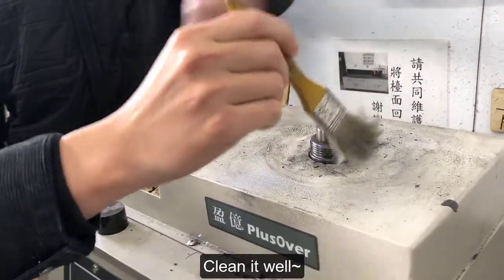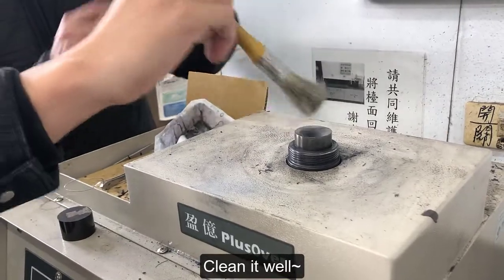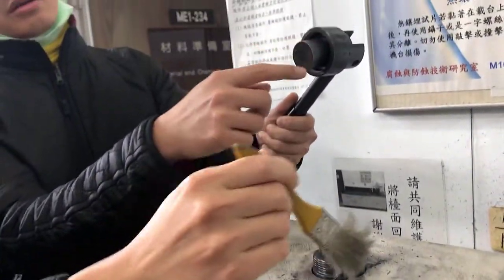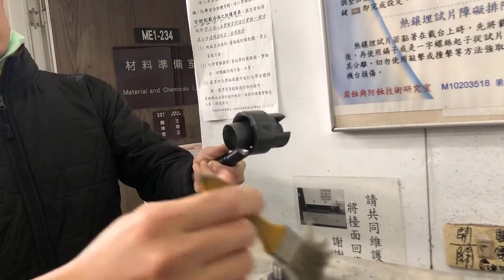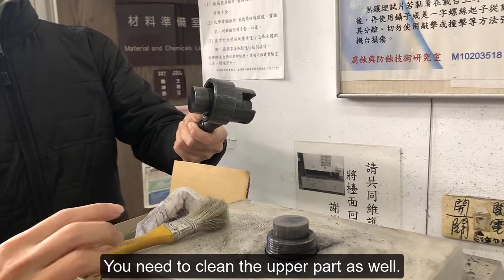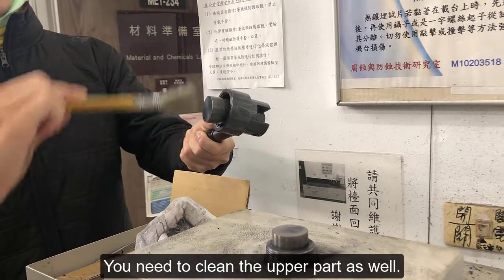Clean the surface from residue left from the previous process. You can use a brush — you need to clean it well. You need to clean the upper part as well.